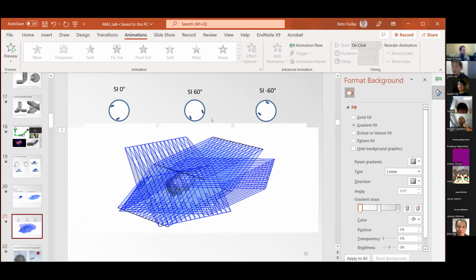And with the alignment as well, I know even with a 2D SIM or a 3D SIM, the alignment can be quite difficult; you have to get it quite precisely right. Yes, that is correct. If you have a TIRF-SIM and all of a sudden one order is clipped or falls into epi, that is correct. It doesn't make it easier, that's for sure.